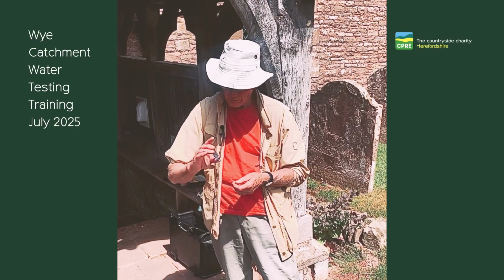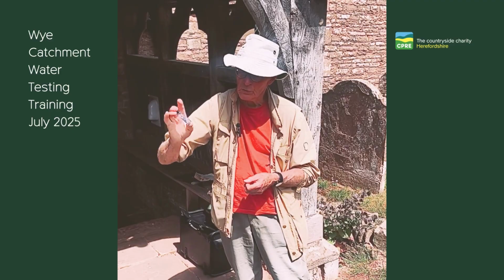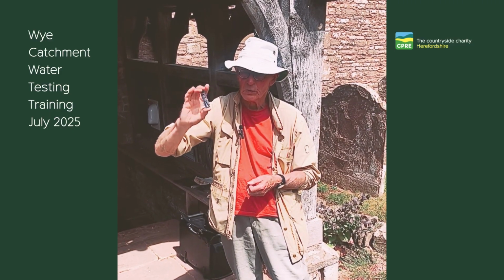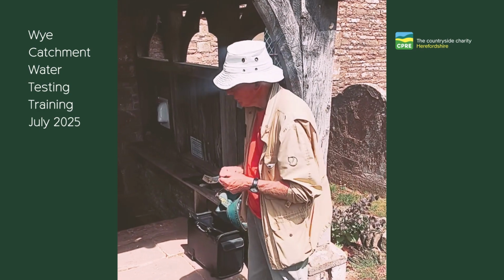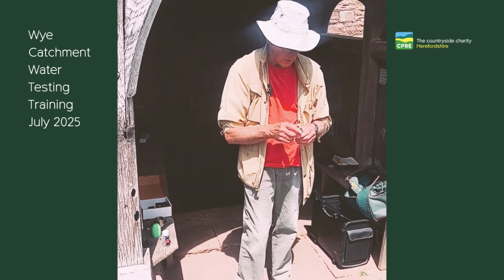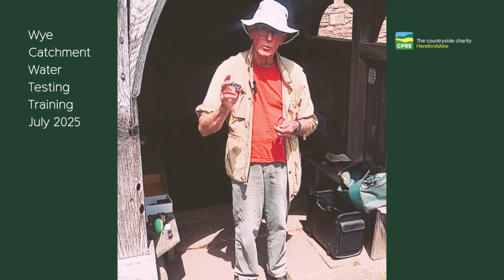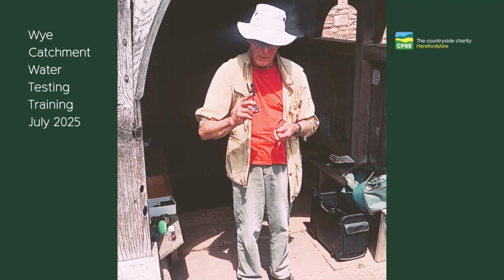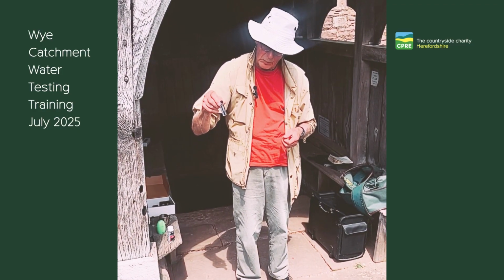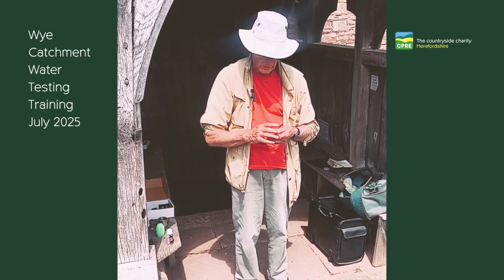Now you'll see something very interesting here. This is the second cuvette with the reagent. It's not fully dissolved yet, but it's already turning quite blue. You can probably see that. And there's an interesting point here, because this sample that I'm using for demonstration today is actually a sample of Welsh water, tap water. It's not taken from a stream. And the reason that I'm doing that is that it enables me to demonstrate what happens when you have a high concentration of phosphate in the water.